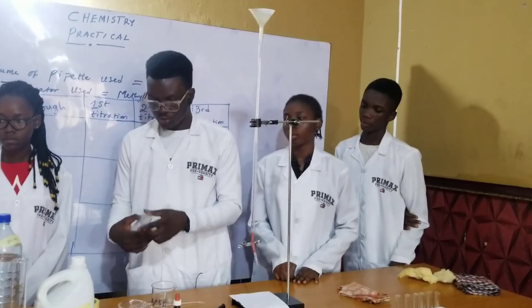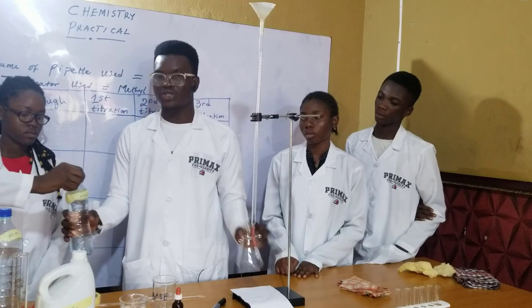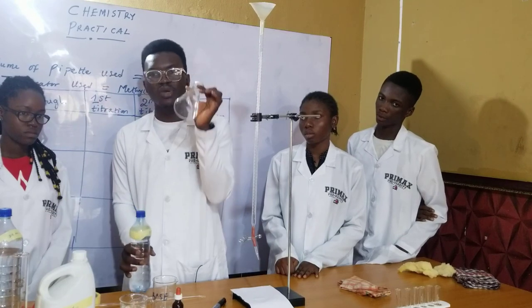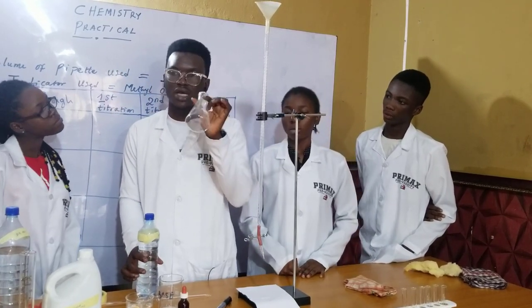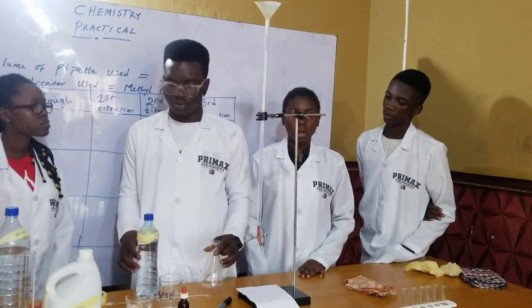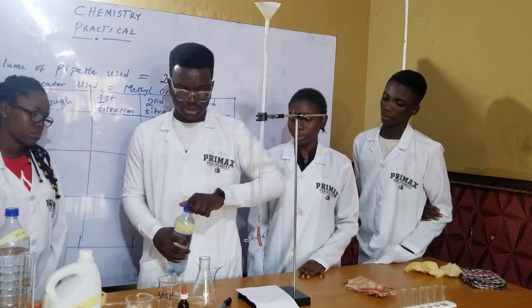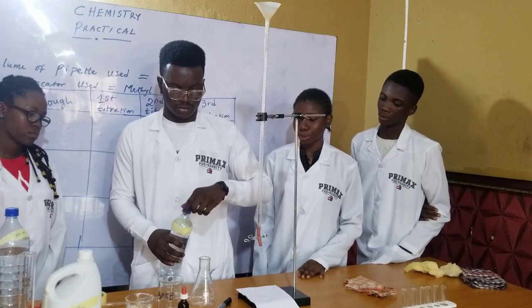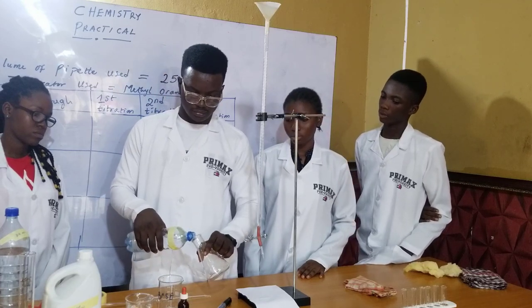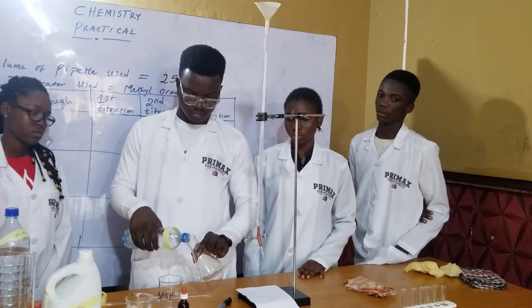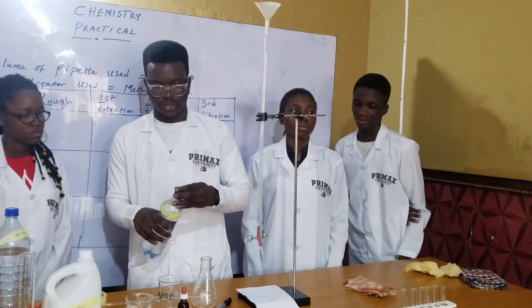The second precaution: you use distilled water to rinse your conical flask before you put your base. You don't use the base to rinse the conical flask — that would increase the volume too much. So use distilled water to rinse the flask.